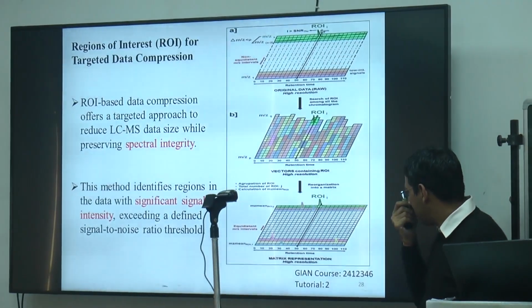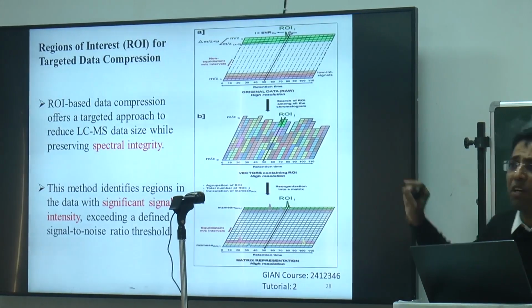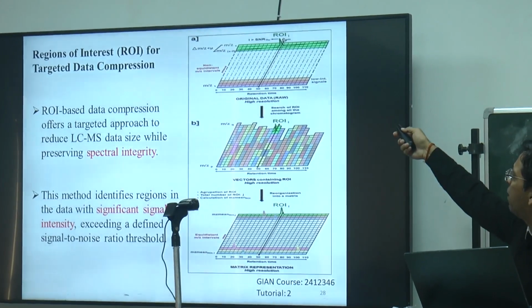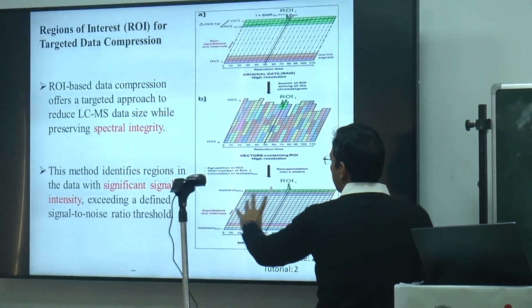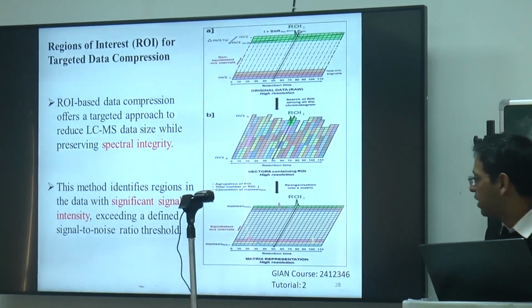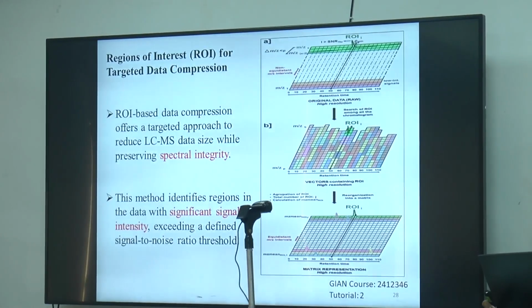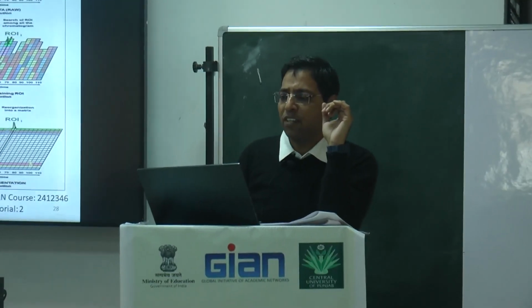When you downsize, you will find that we try to maintain the resolution because we are focusing only on the small area, not the whole area. Only that particular area, and finally you reduce it and come this way. So this matrix represents the high resolution even when you are focusing only on the region of interest. This is the second way of compressing the data.